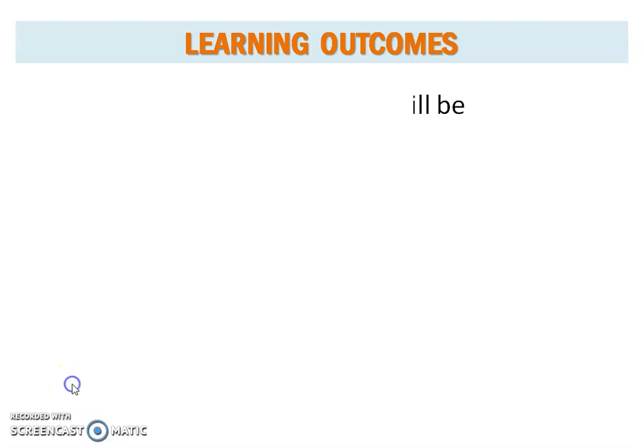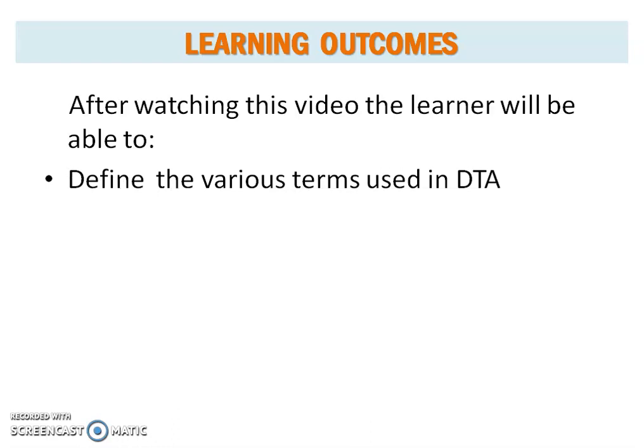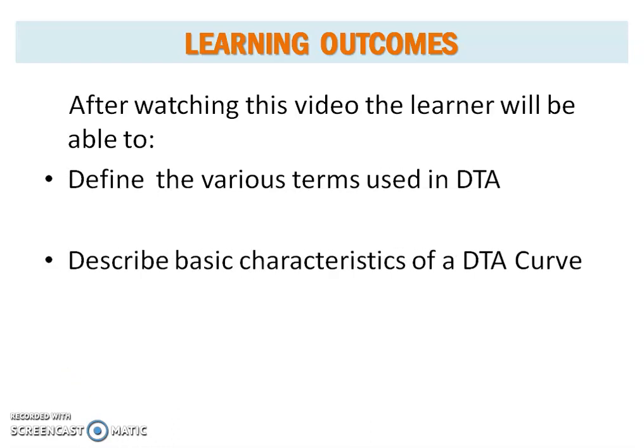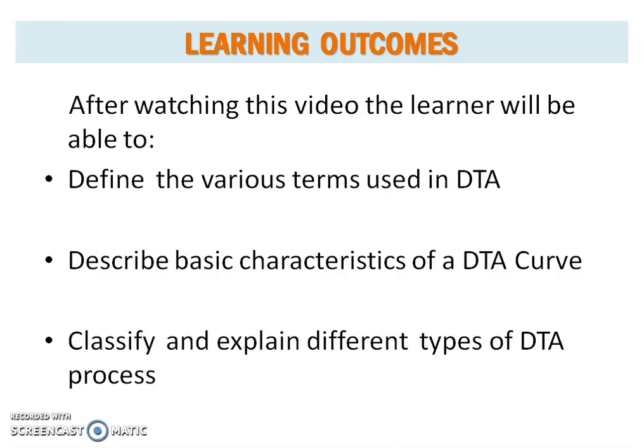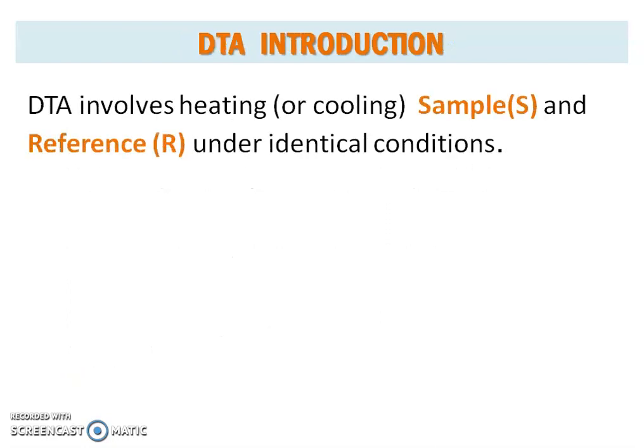Learning outcomes. After watching this video, the learner will be able to define various terms used in DTA, describe basic characteristics of a DTA curve, classify and explain different types of DTA process. So let's get started. What is DTA?